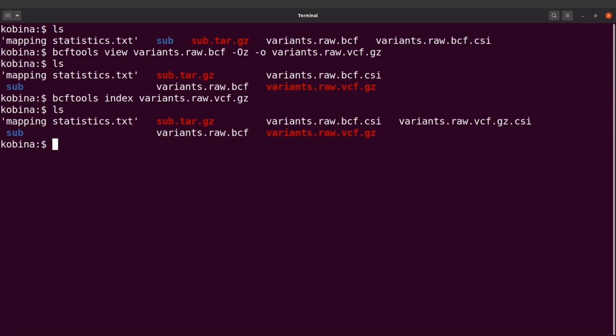We can also perform some basic statistics. So that's what we are going to do next. Whenever you call variants, you can perform the basic statistics just to scan through your result, and then you can proceed with the other analysis. So let's perform some basic statistics. We are going to count the number of variants.